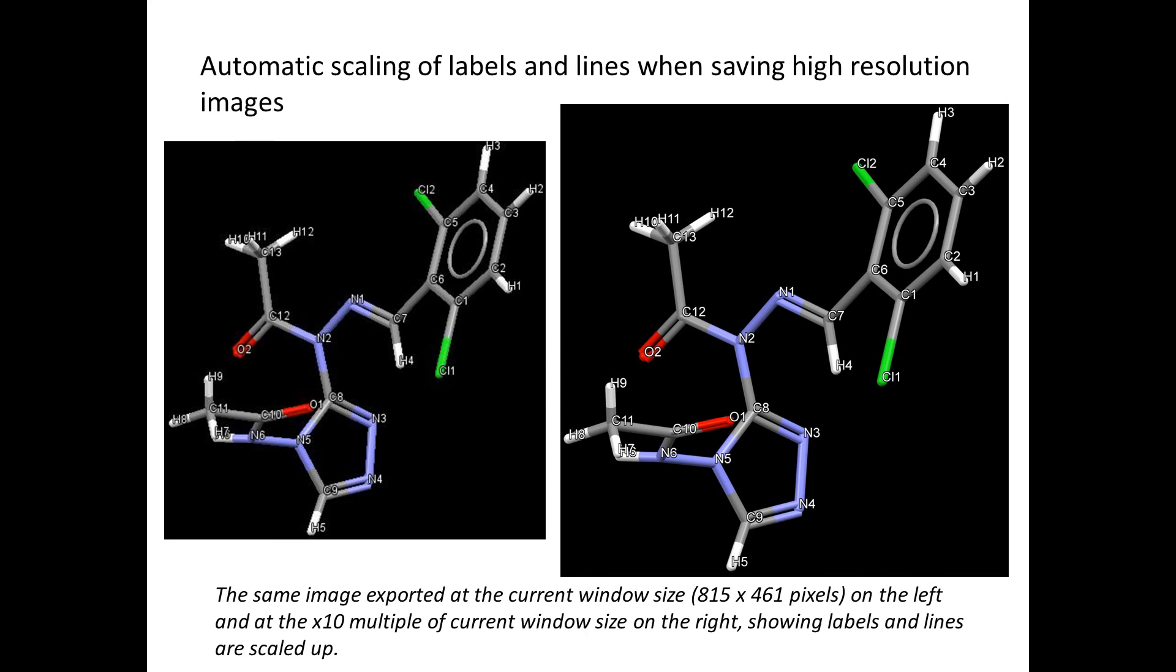We have also introduced automatic scaling of labels and lines when saving high resolution images. Here we're comparing on the left the same image exported at the current window size, and on the right the same image but at 10 times the multiple of that current window size. This shows that when you have a high resolution image, the labels and lines are completely scaled up.